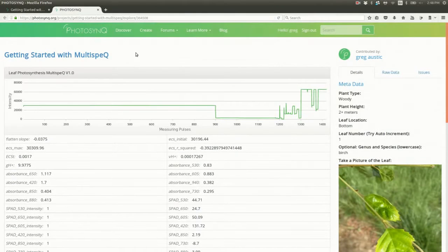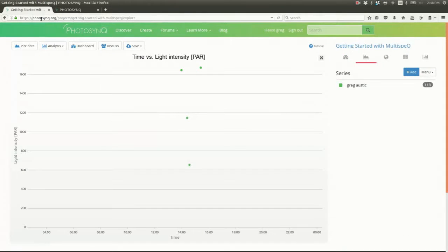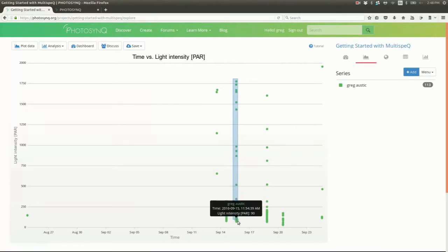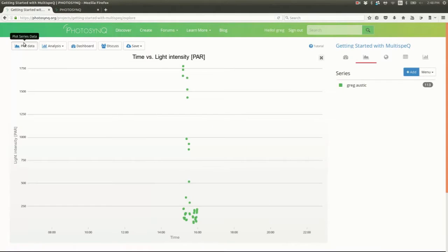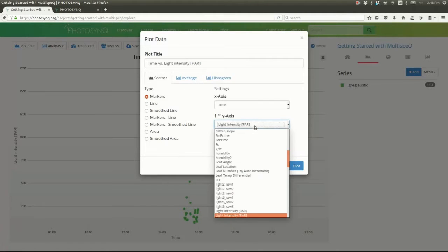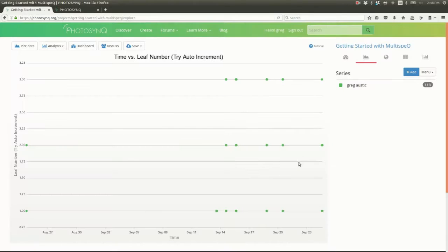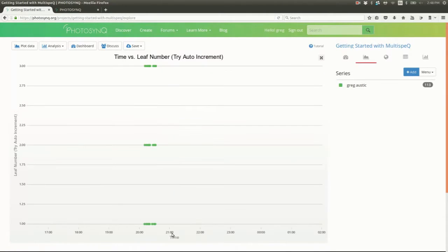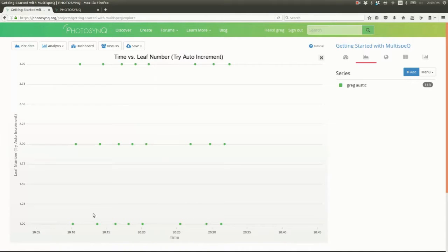Now let's make sure I collected the data correctly. I tried to collect three data points at each leaf location: top, middle, and bottom, in that order. Let's put leaf number on the Y and zoom in. Wow, looks pretty good actually.